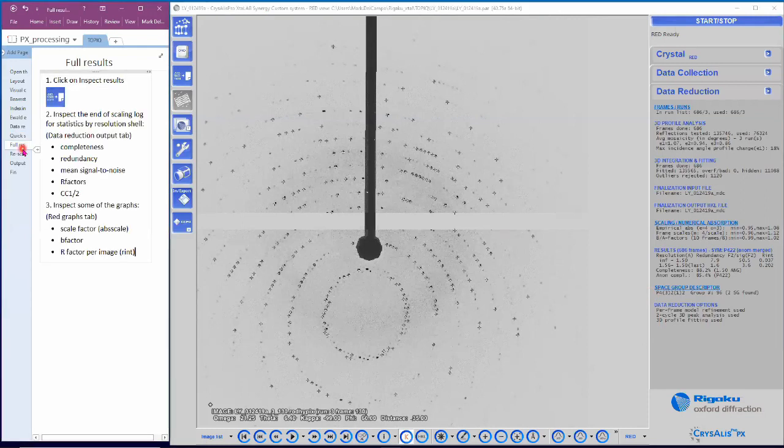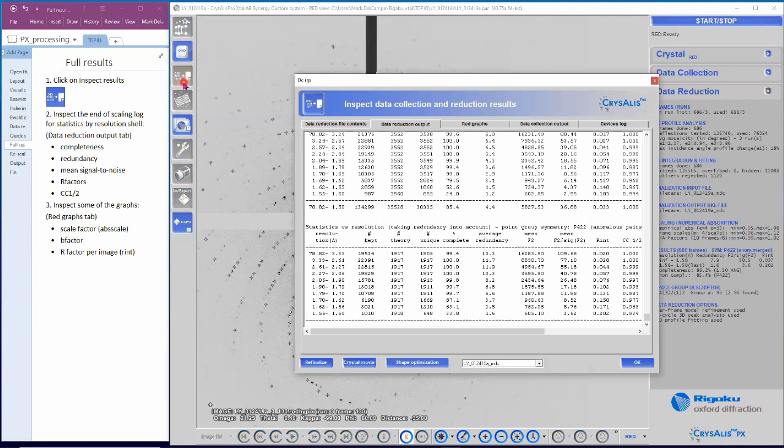If you want to look then at the full results, you need to click on the results inspector. The third button down on the left has a series of 1s and 0s and an arrow pointing to a piece of paper. This is the results inspector. So I click there, and the inspector launches, and what I'm going to do is resize it.